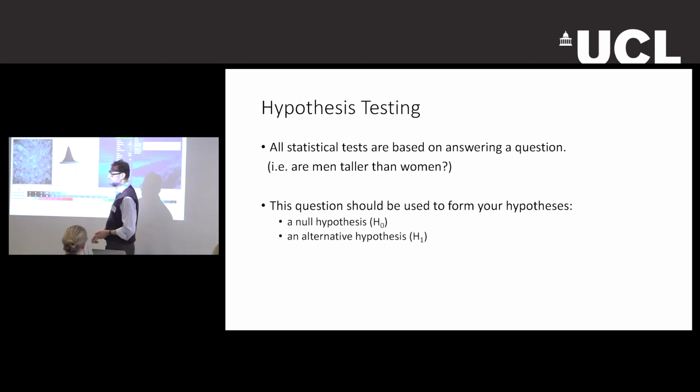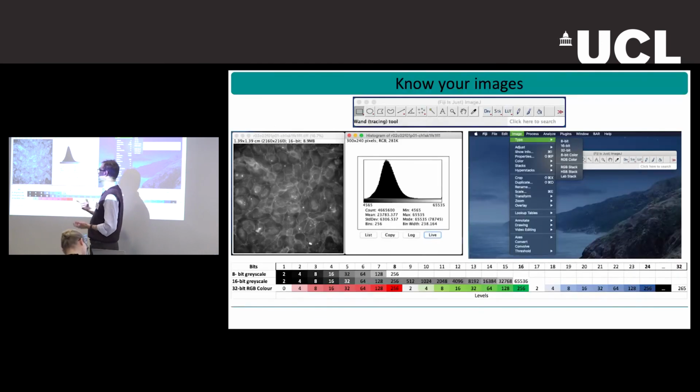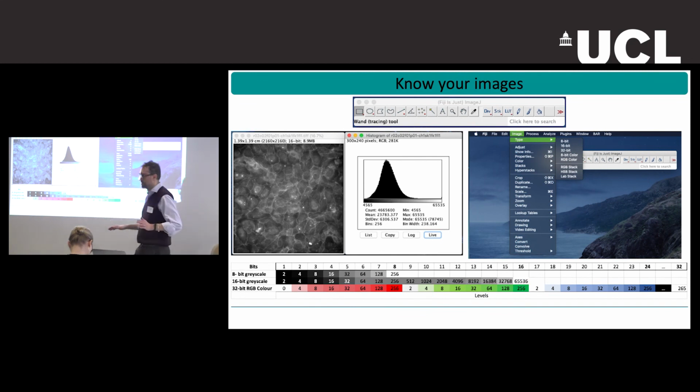The histogram represents where your information is. So in image analysis, you are probably looking to put a line here and tell me what's positive and what's negative. This becomes trickier because your eye and the computer also filter things according to other algorithms, not only intensity. But the very classic image analysis was threshold-based on intensity. So you say, tell me what's positive, tell me what's negative.